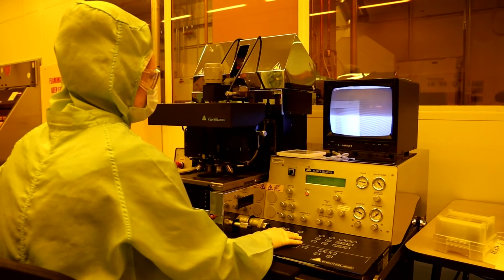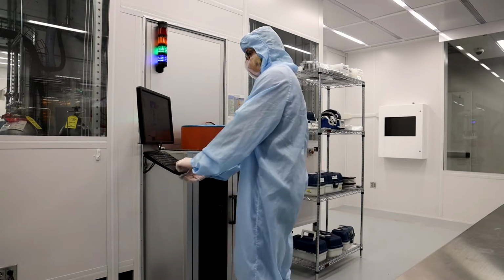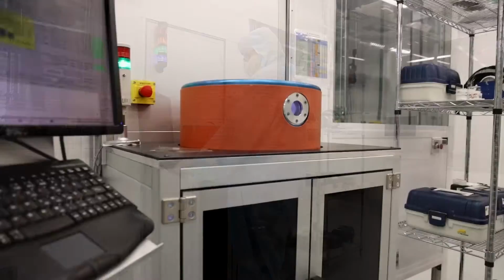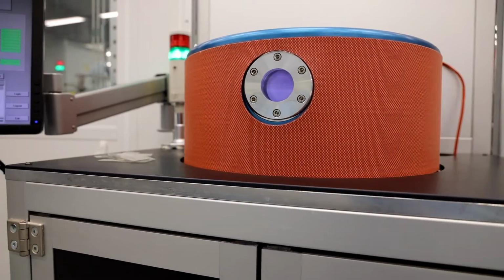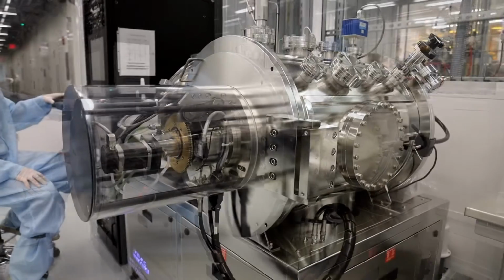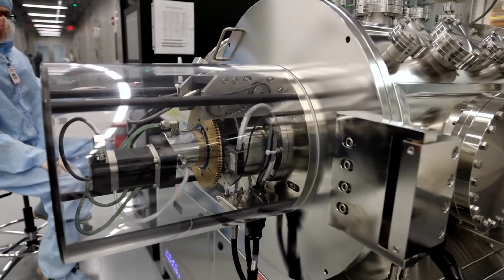Finally, after developing and removing the exposed resist, the pattern can be etched into the wafer using acids, bases, or energetic ions called plasmas, or by depositing new material into the exposed areas. This process is often repeated multiple times to build up the components that will become a working device.